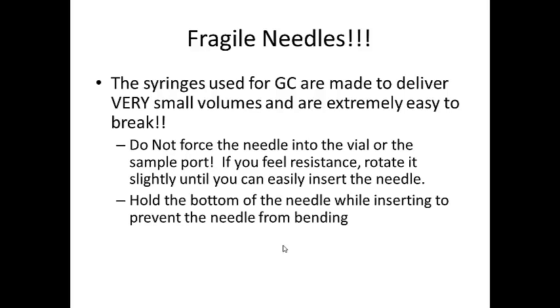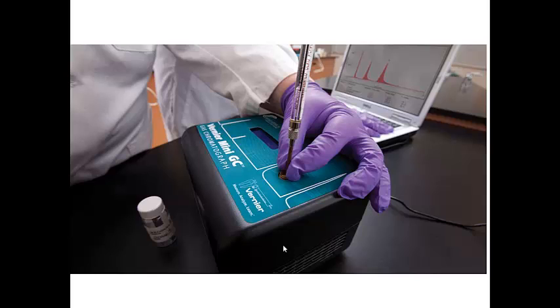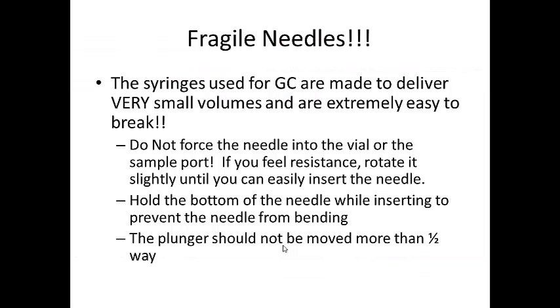You will support the bottom of the needle when you insert the needle into the sample port. And let me show you the picture of that. Right here, there's the student holding and supporting the needle while they inject. Do not pull the plunger all the way back. The most it should be pulled back is halfway. That will prevent it from being pulled out the end.